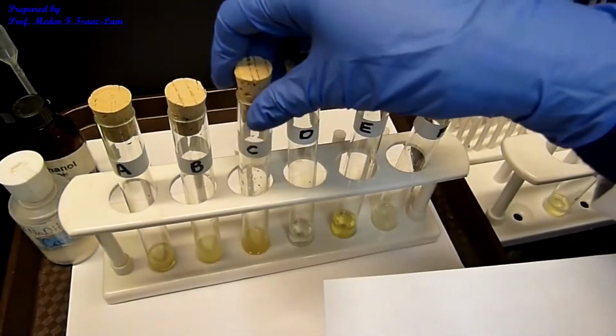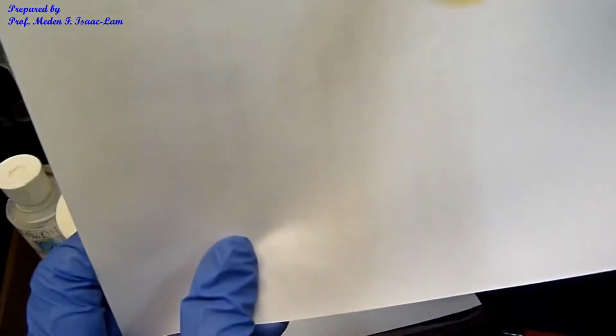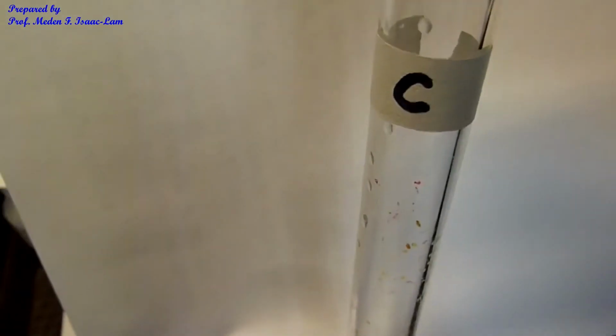You can see after it's settled. So this is B, and that's the precipitate at the bottom. And then also C, this is unknown C. Okay, you can also see precipitation at the bottom.